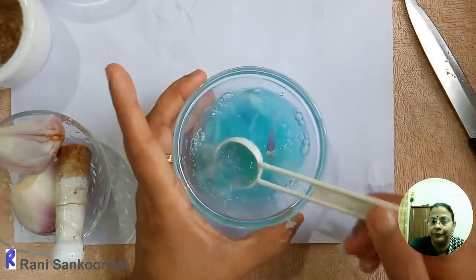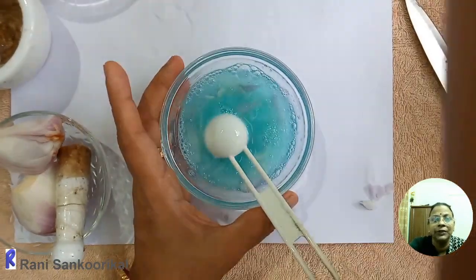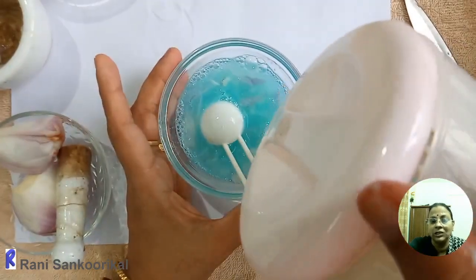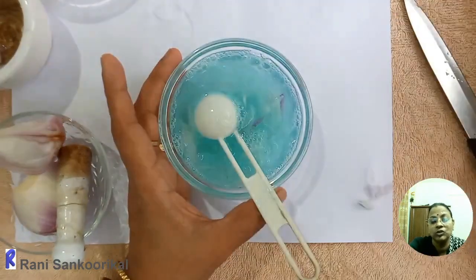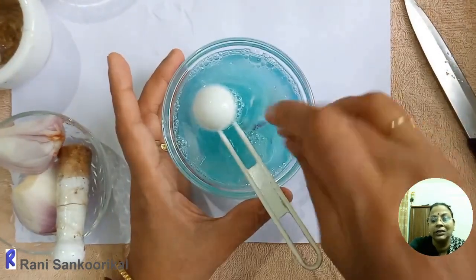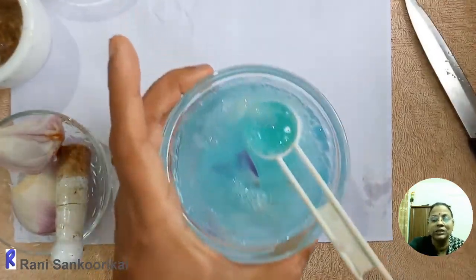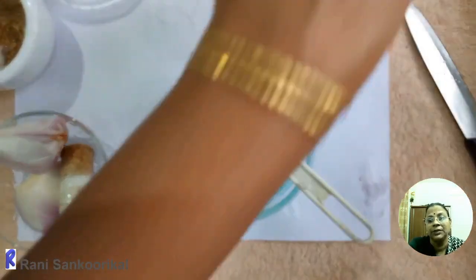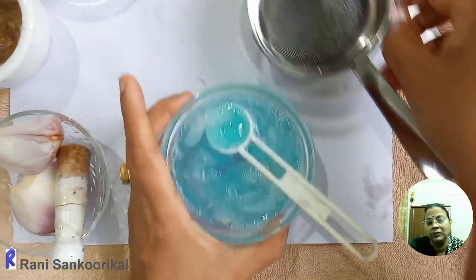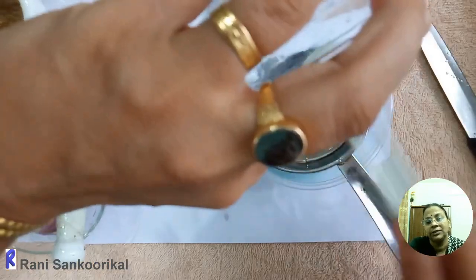Again stir it well, and you have to keep it aside for 5 minutes approximately. Make sure that the frothy appearance is gone. If the solution is too thick, you can add a little more water to make it thin, and then only you will get a clear solution of the mixture. Otherwise, if it is too thick, straining will also be difficult. So make sure it is of moderate thickness, and you can strain it with the help of a tea strainer.